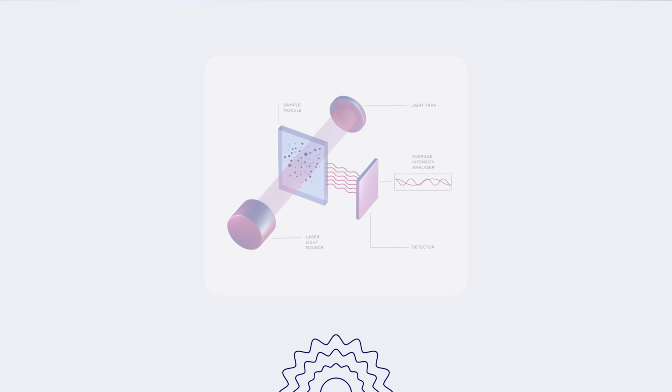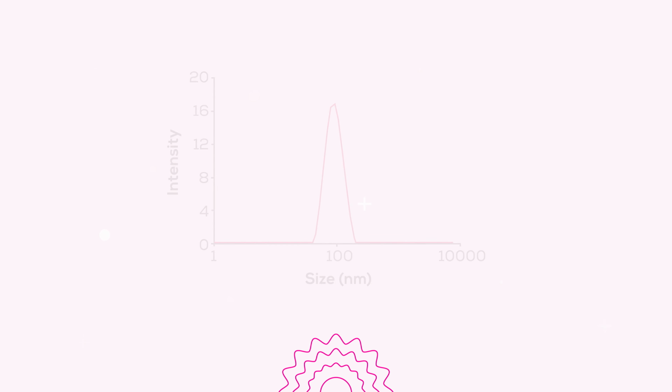For many years, the go-to method for measuring these intricate, cleverly designed lipid nanoparticles is one with some pretty major limitations. That method is dynamic light scattering, or DLS. While DLS is a quick and easy-to-use method that gives you an insight into the intensity of light scattered by particles in solution, measuring light scattering is not the same thing as measuring particle size or concentration directly. However, it's what most people seem to be doing. But is that really a solid rationale for choosing an analytical technique? Let's delve into some data.